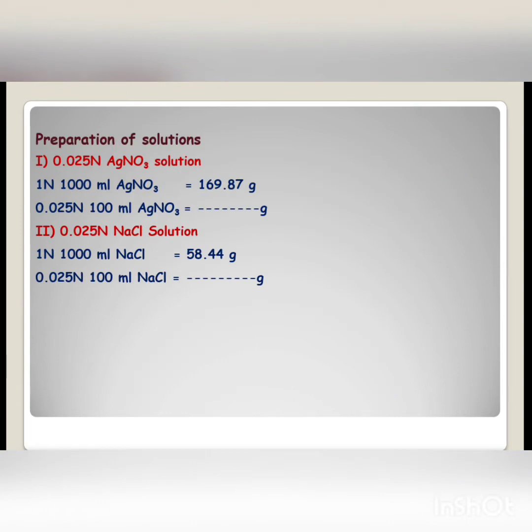And after all chloride ions are consumed, the first drop of Ag+ in excess will react with the chromate ion indicator, and it gives a reddish precipitate. That reddish precipitate is of silver chromate.